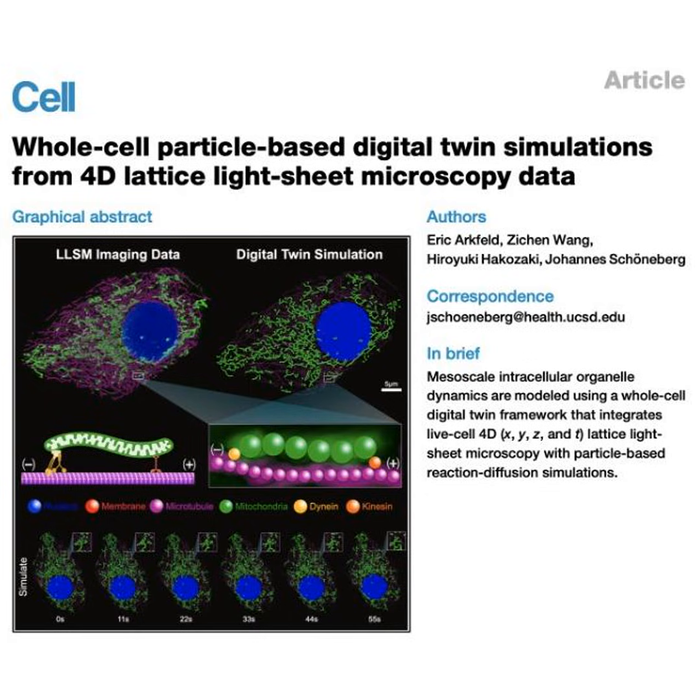So the very act of observing the cell kills it. You can't model healthy traffic if you're actively setting the city on fire with your camera. Exactly. It's a hugely frustrating catch-22 in biology. So how did this team get around the phototoxicity problem? Because clearly they didn't burn these cells. No, we didn't. And that is where the technological breakthrough in this paper begins. They utilized a technique called lattice light sheet microscopy, or LLSM.